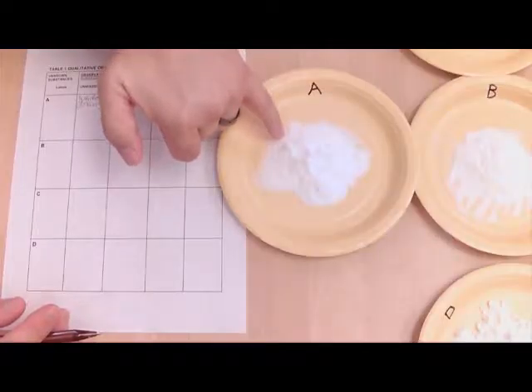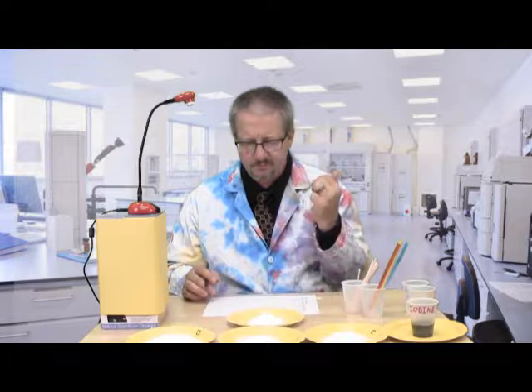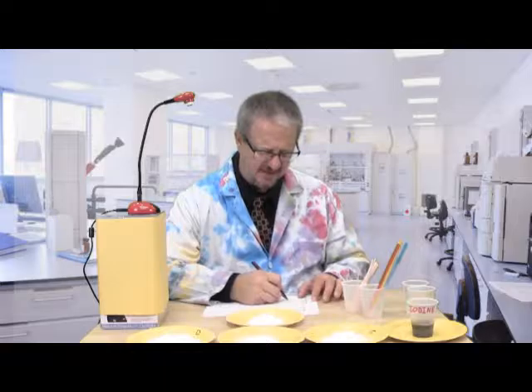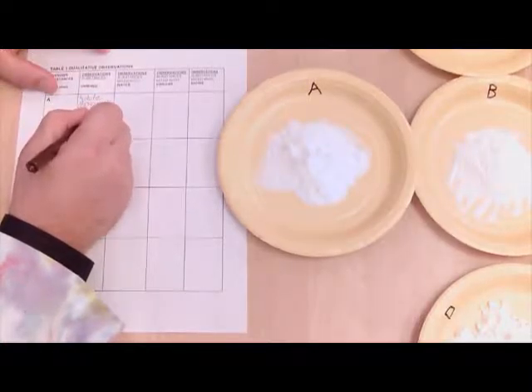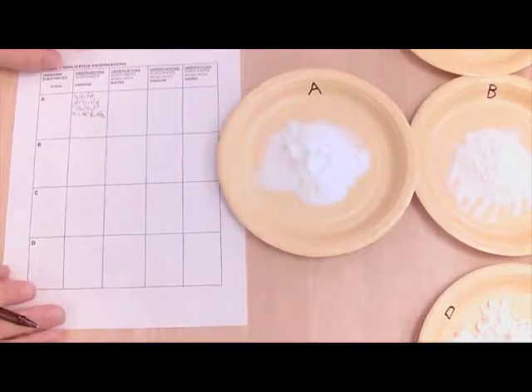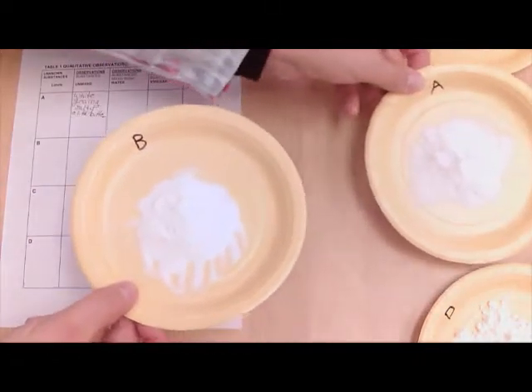So let's try a little taste test. Dip a little bit of powder on the end of my finger and I'll taste it. Doesn't taste good. It's salty and a little bitter. Okay, and so I think I've done all 5 of my senses. So we'll move A out of the way. We'll bring in Mr. B here.